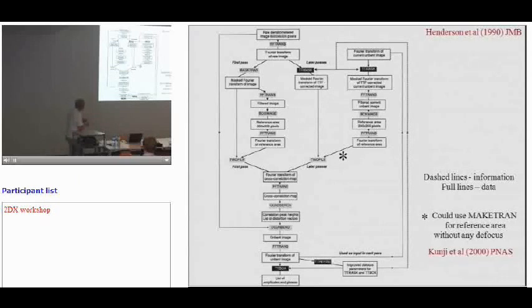So you then have an unbent image where all the unit cells are exactly in the right places. You then Fourier transform that, and you look at it, and you've got all sharp spots. So you've gone from what might be a somewhat deformed crystal, and the extent of the deformation obviously is limited, and if it's too bad, you might have to go to single particle and so on. So the software was written to do some unbending, but obviously it runs out of steam if the deformation is too big. And exactly where that is, you have to judge.